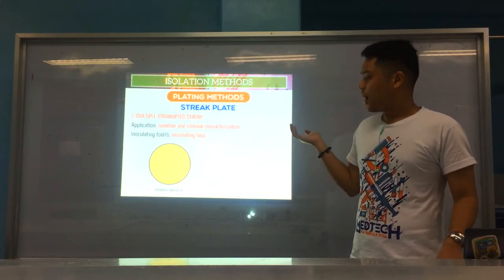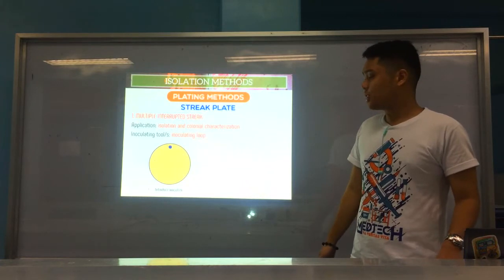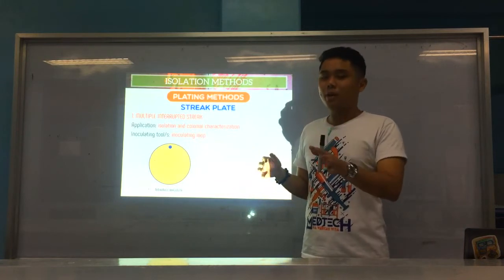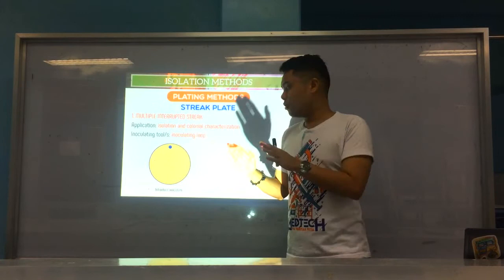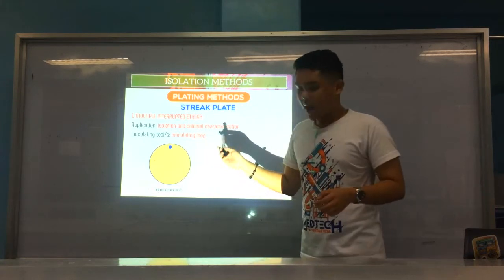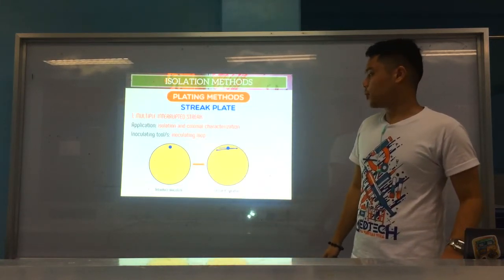So let's say you have a culture medium and you are yet to introduce an inoculum. You introduce an inoculum usually at one side, and usually in my video, you label your plates at the back. So here you put the inoculum to start. Usually just a drop of the inoculum using a loop, and then finally you streak the first quadrant.